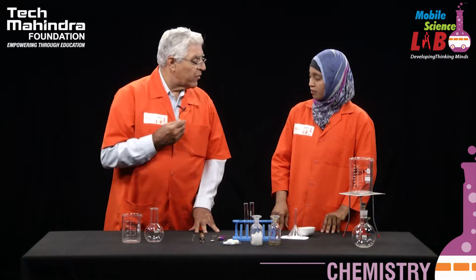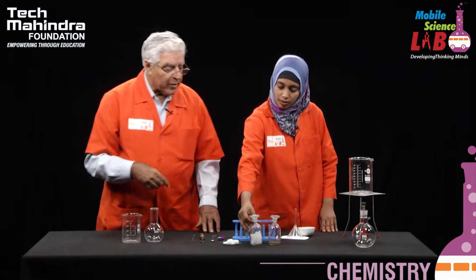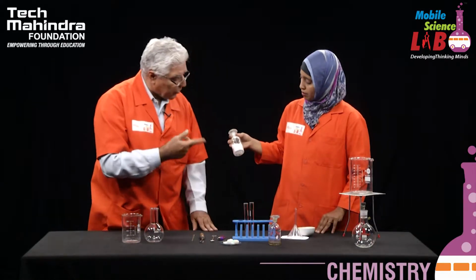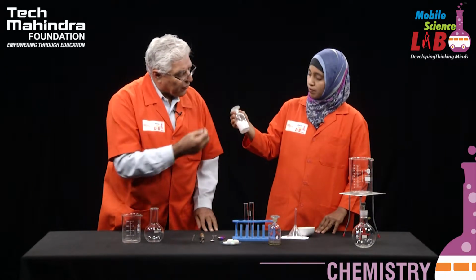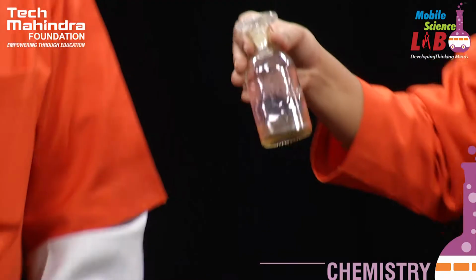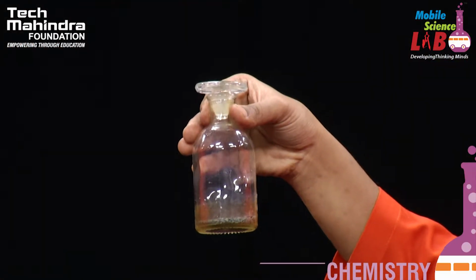One of our common examples is camphor. Many people use it for pujas. Another one is iodine. Hold it and show it to the viewers. These are camphor tablets. And in the other bottle, we have got iodine.